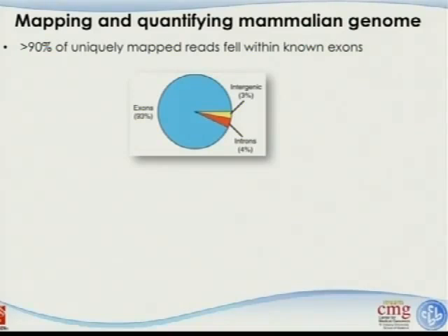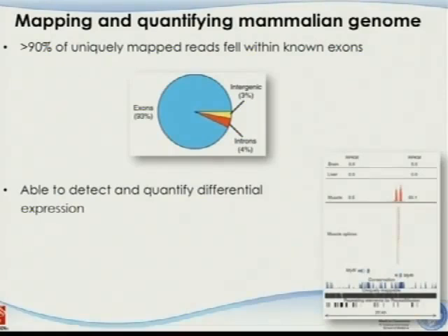One of the reasons they can achieve this high percentage, I think, is that they did poly-A selection. So they focused mostly on the mature messenger RNAs. But if you do another type of assay, if you use random primer and ribosome depletion, there's no way you can get such a high percentage. But this is what they got.